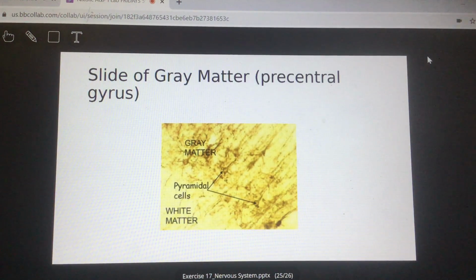That is, as the label implies, a gray matter. Now, unfortunately, the area over here that has less density of these dark areas, that is the white matter. It's not truly white. In some images it is, but in this case, it's just less dark. Unfortunately, that's kind of how the gradient of gray matter to white matter looks.